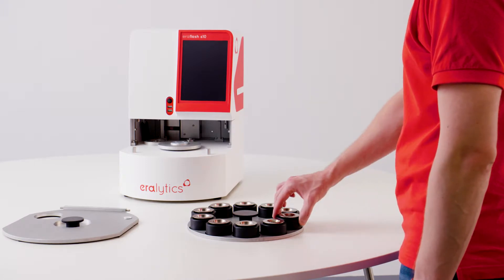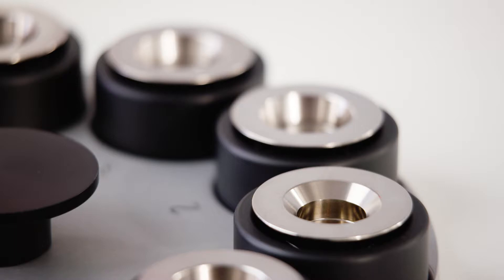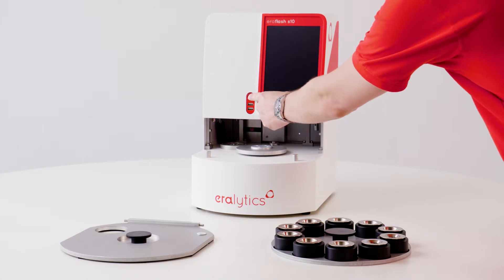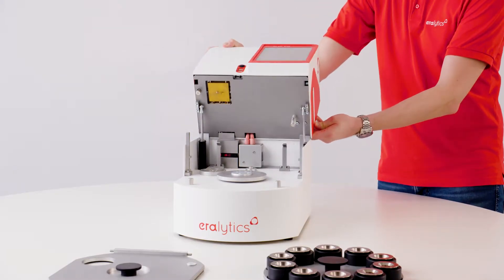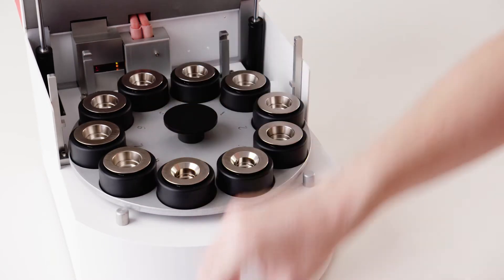Assemble the sample cups. Use the 1 milliliter sample cup for D6450 or the 2 milliliter cup for D7094 measurements, as well as all other methods. Switch on the instrument by pushing the power button. As soon as the measure screen is loaded, open the control case. Insert the carousel and turn it carefully until it snaps into position.